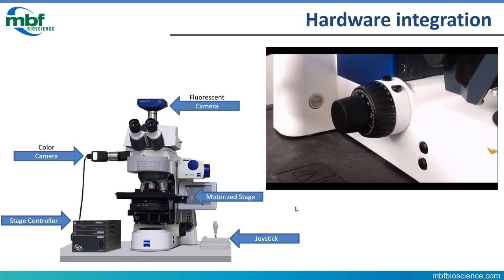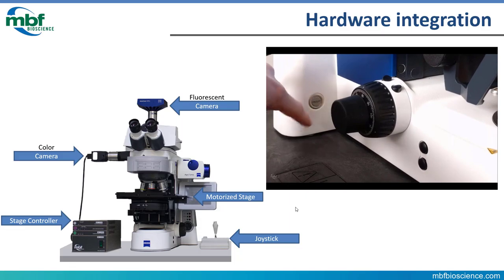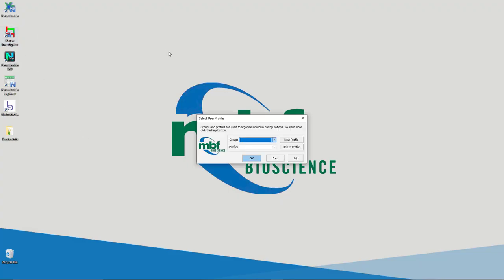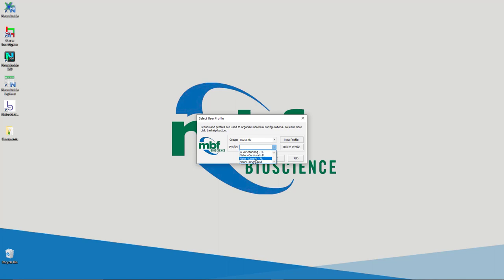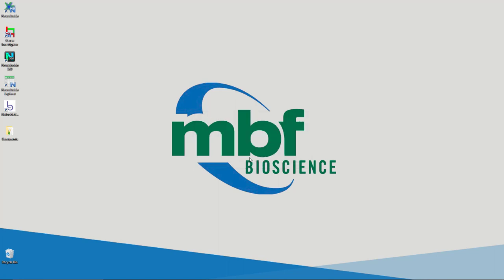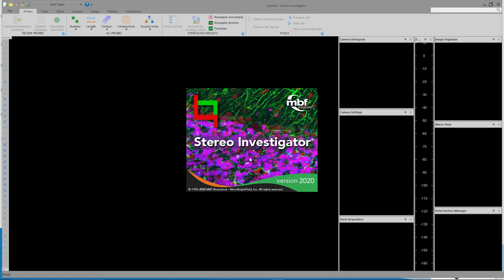Let's power up our system and start up the program. To begin, I'll double-click the Stereo Investigator desktop shortcut, then select my group and then the profile. Groups and profiles are a fantastic way to organize settings in Stereo Investigator, either by lab, by project, or by person in your lab — to keep different users and different projects from interfering with each other's settings or configurations. For this particular project, I'll select the profile set up to use it and click OK. Stereo Investigator will launch and read in those settings.